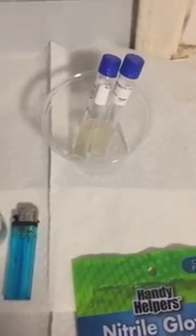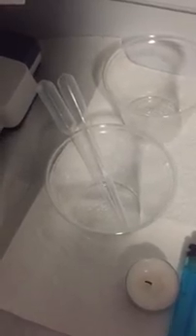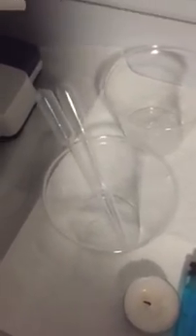And then I have my two broth, the S. epidermidis and cerevisiae, can never pronounce that. We do have our candle and our lighter that will disinfect the tubes. I have my pipette to pipette the organisms culture to my nutrient broth. I have an alcohol solution so I can disinfect the pipette before using, and I have another cup that we use to put my used pipettes.